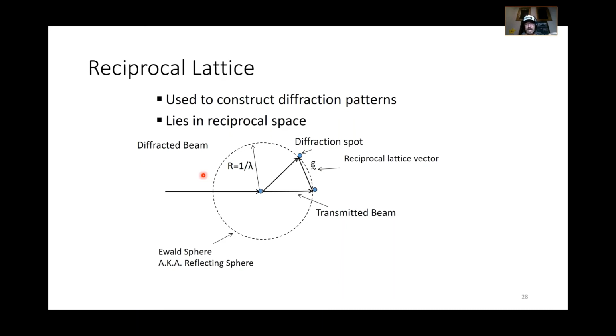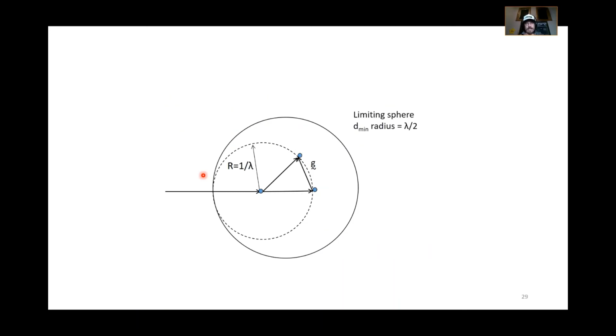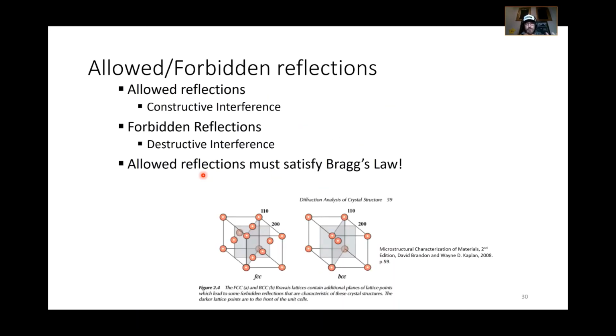Reciprocal lattice is a construct we use to actually interpret patterns. I don't talk about it much here because most of what we do in modern X-ray diffractometry is interpreting spectra. For spot methods like single crystal diffraction, what applies to electron diffraction will be greatly applicable to single crystal. So if you're looking for that, just wait till we start talking about TEM. I think I'm going to go ahead and stop now and really just save it for electron diffraction.